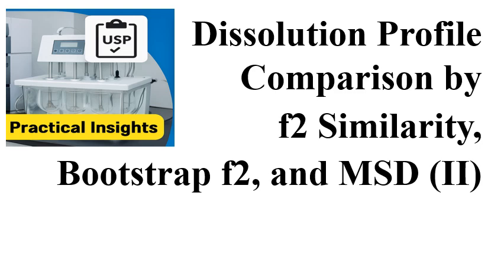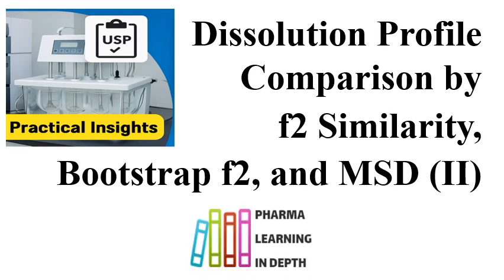There are different methods for dissolution profile comparison, and this video is regarding those three methods mainly. First is F2 similarity, then Bootstrap F2, and third one is the MSD method for dissolution similarity. These methods are used to demonstrate that the dissolution of the test formulation is similar to the reference formulation, or in comparison to the reference formulation.